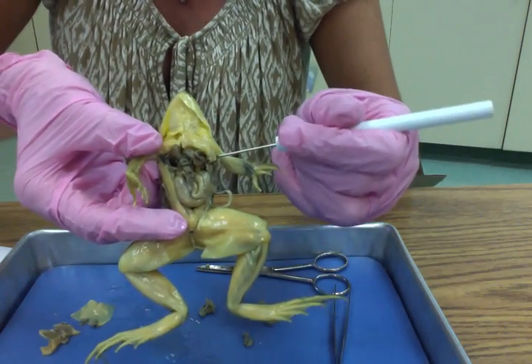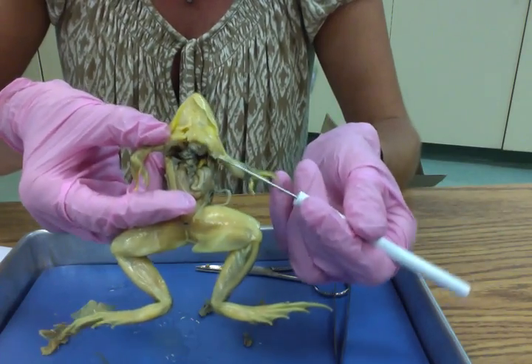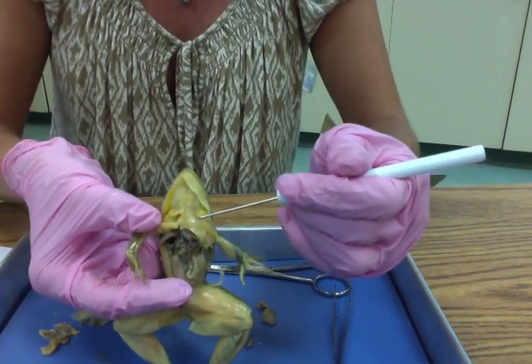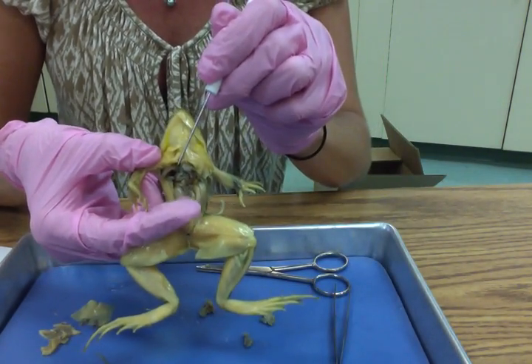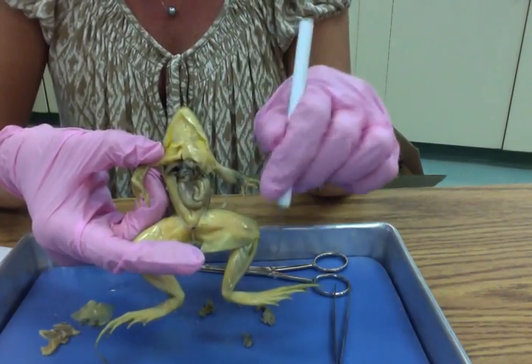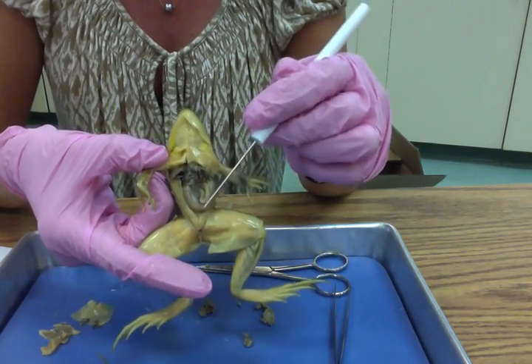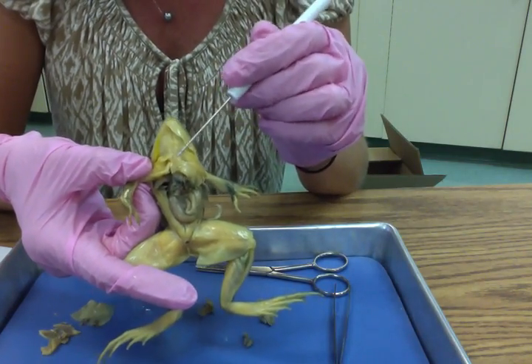Notice I had to kind of pull them out from underneath. These spongy structures are the lungs. And the lungs are responsible for giving oxygen to the blood so that the heart can pump that oxygenated blood throughout the body and provide oxygen for all of the chemical reactions that take place inside of the frog.